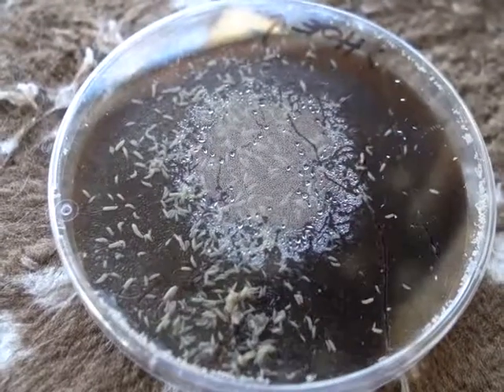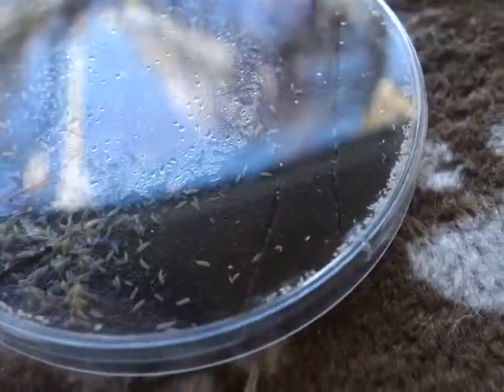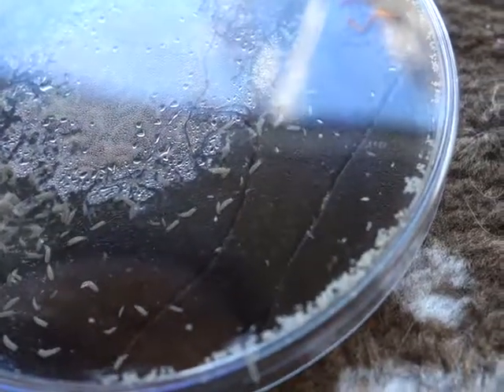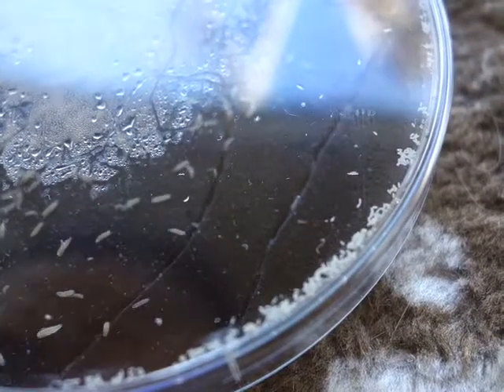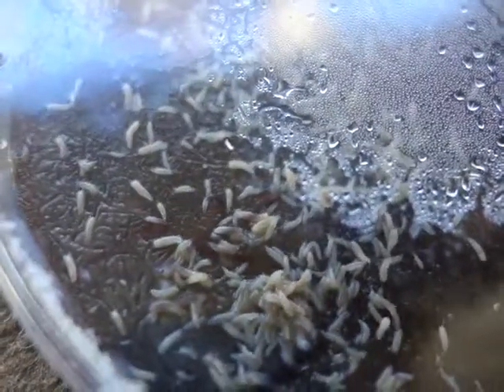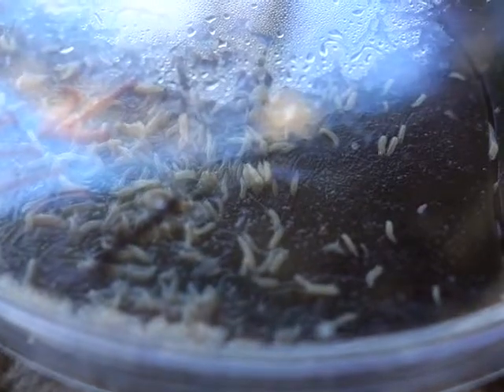This is what I did. I took some pond water and I put it in here. I've been told it's not a good idea to look at that, it's not a good idea to open up something that you don't understand, and I'm not sure what is growing there. These things move. These things look like — well, there is something in that pond water.